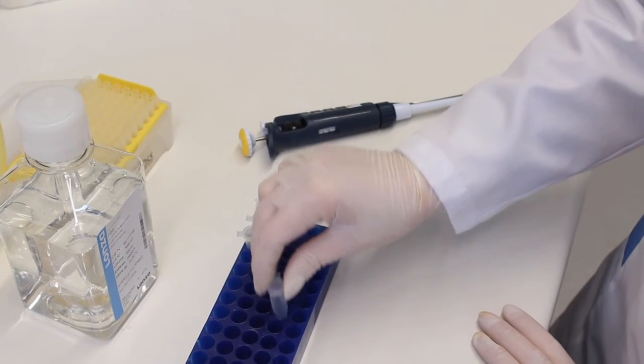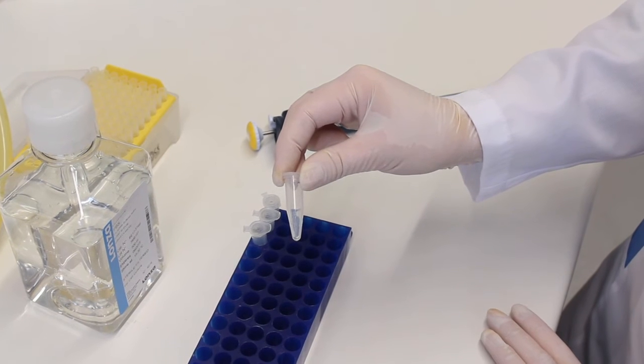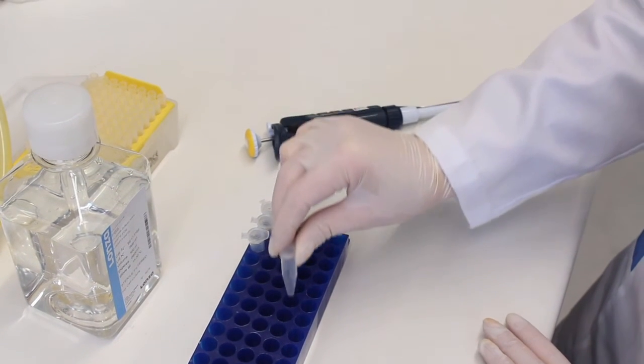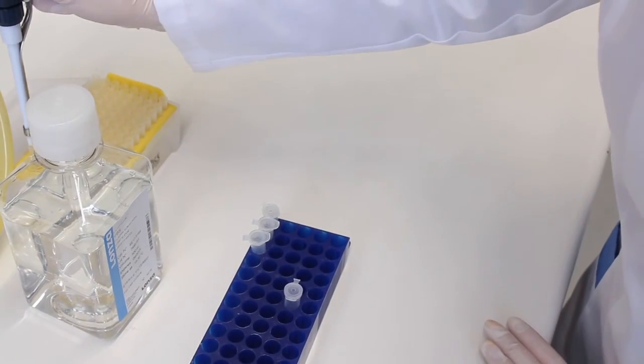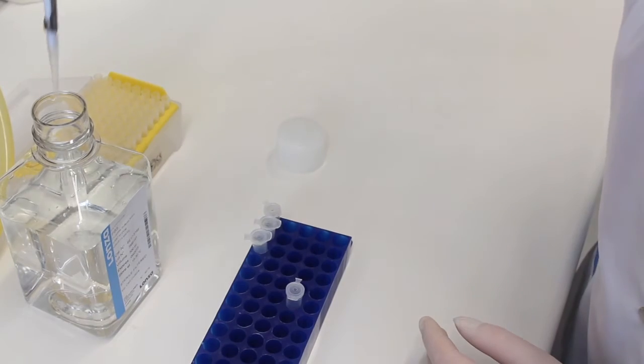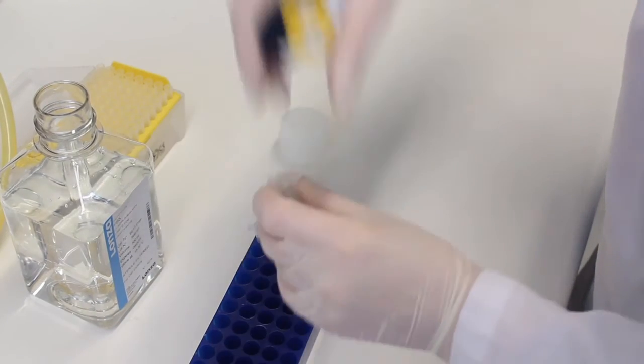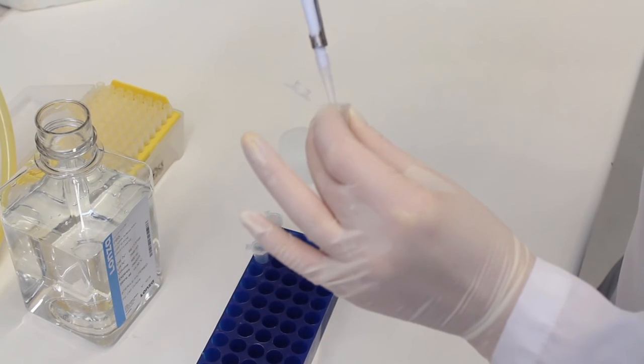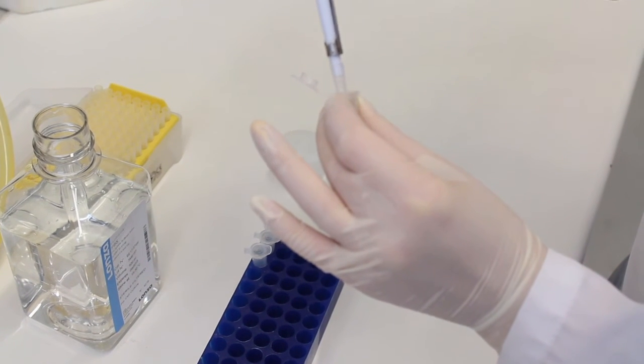The pellet are exosomes which can be almost invisible or look like a thin transparent film. Resuspend the pellet in 100 microliters of PBS for ELISA analysis. Or in any other volume appropriate for other analysis.